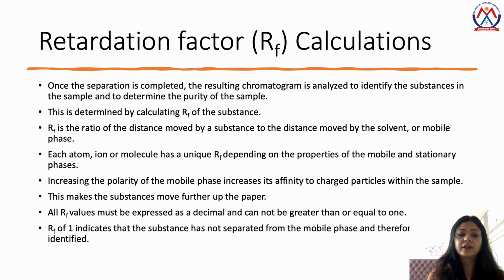Now, retardation factor. What is retardation factor? Once the separation is completed, the resulting chromatogram is analyzed to identify the substances in the sample and to determine the purity of the sample. This is determined by calculating the retardation factor of the substance.